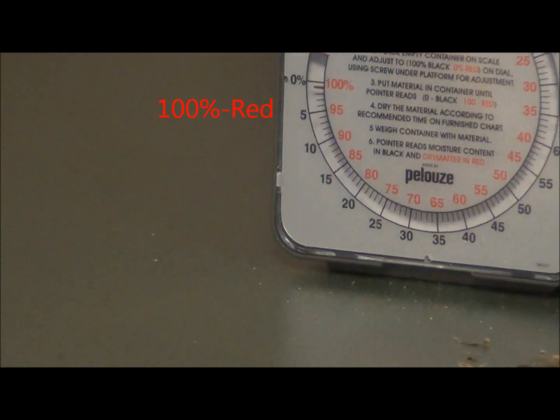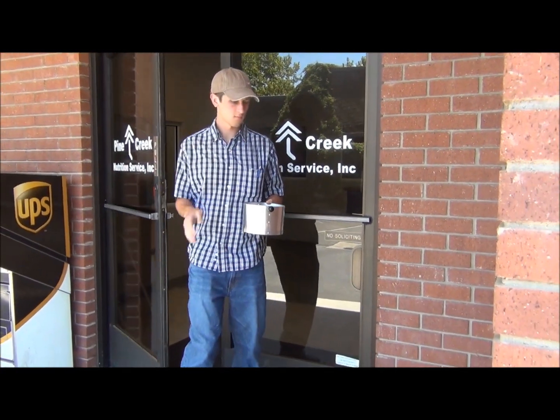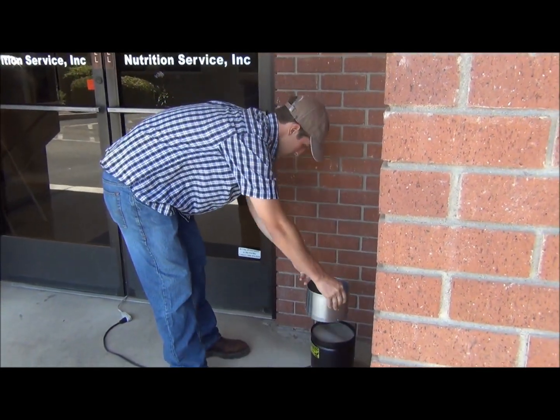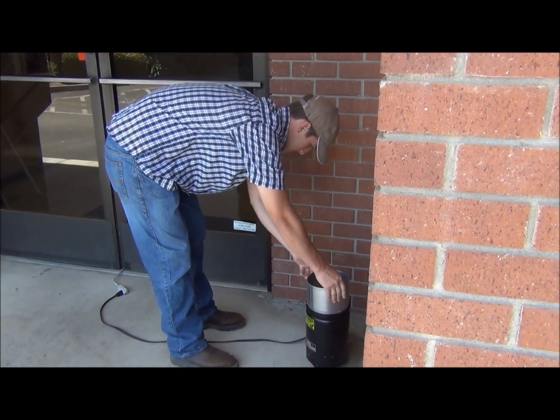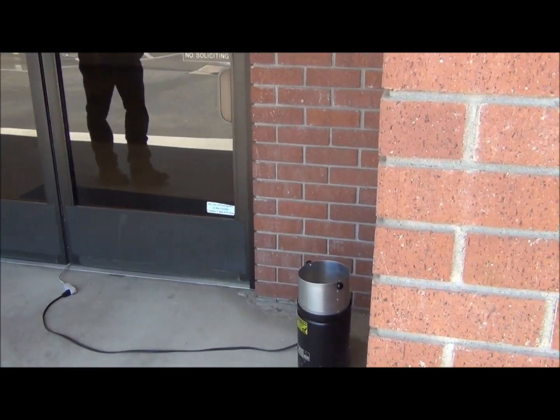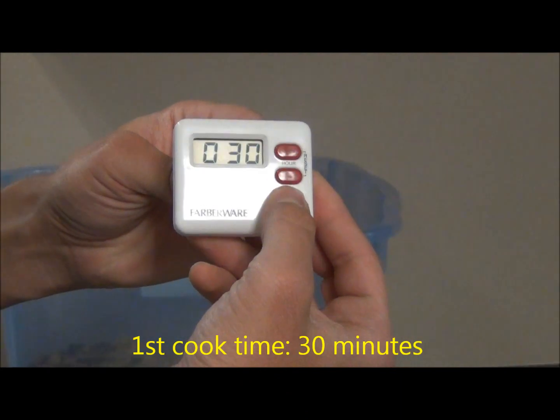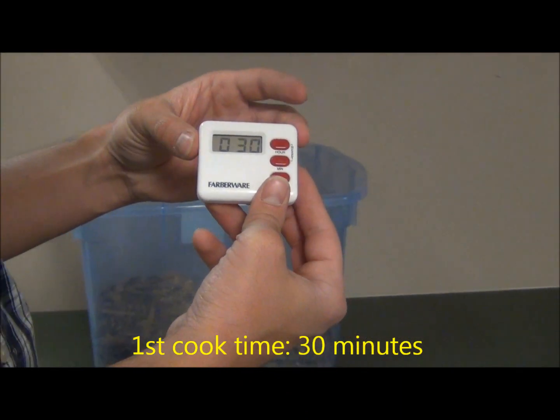Place the specimen container on the evaporation unit. When drying down feeds of any kind, be sure to always use caution as the evaporator may be extremely hot. Also, always ensure that there is proper ventilation when cooking samples and never cook them in a confined area. Dry the sample for 30 minutes or the established drying time.